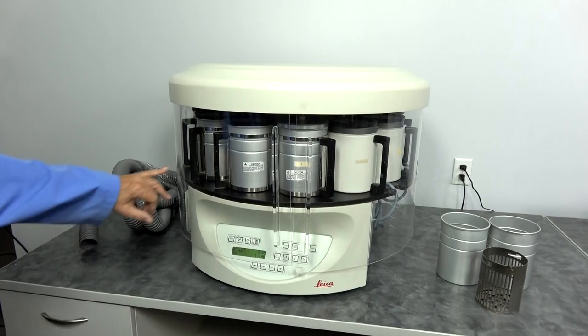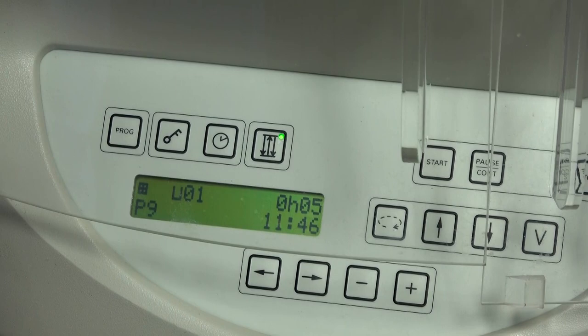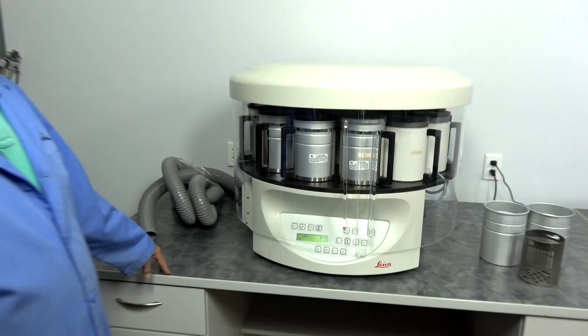The unit will also, on the display, give you which reservoir the sample is in, and the amount of time left in that reservoir. And that's the TP1020 Leica tissue processor. Thank you.